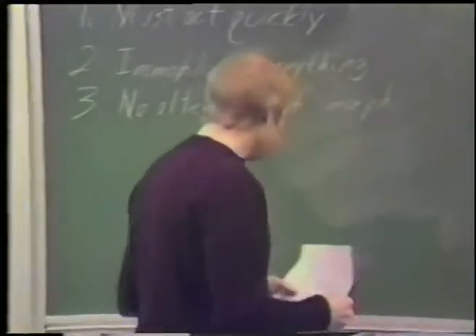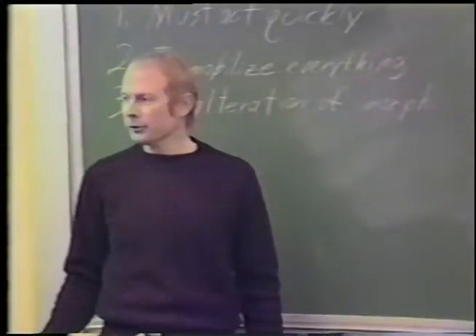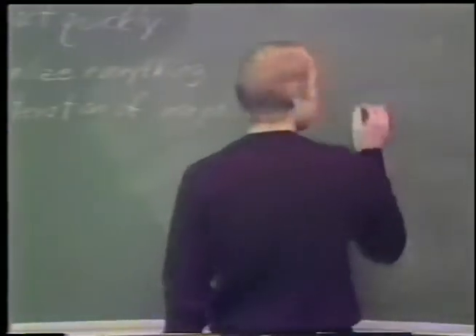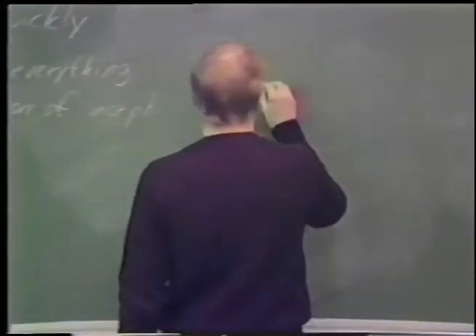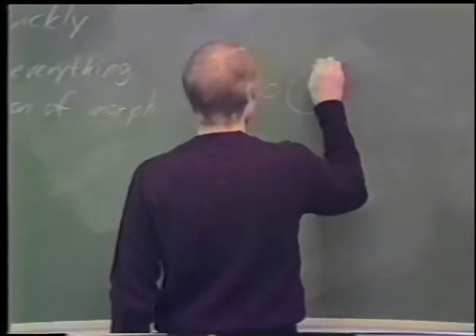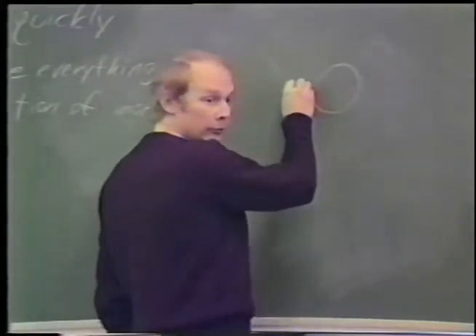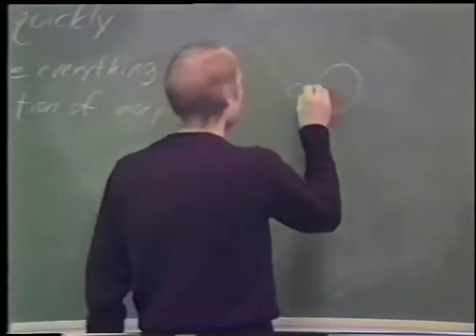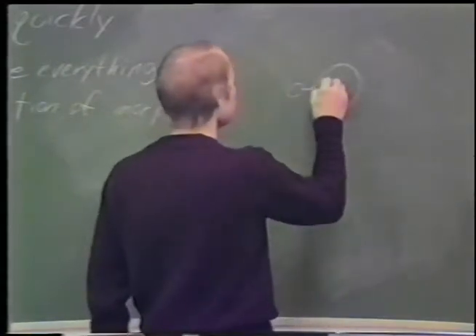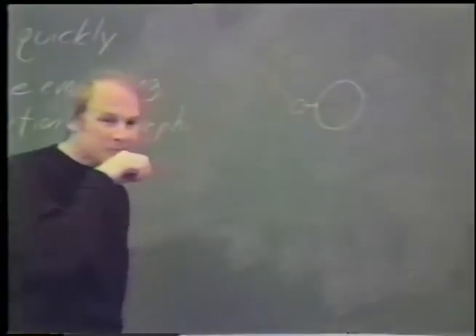Now, once one has the sample ultra-rapidly frozen, you have to keep it cold. If you don't keep it cold, because of the surface energy effects that we were talking about earlier, there are a couple of ice crystals side by side. If you get it warm enough, water molecules can migrate from ice crystal to ice crystal at the boundary. And that means the larger ones will grow at the expense of the smaller ones, because the surface energy of the smaller ones is greater.